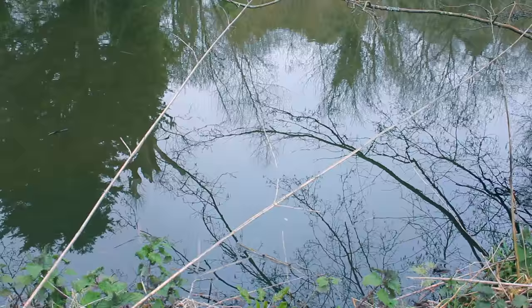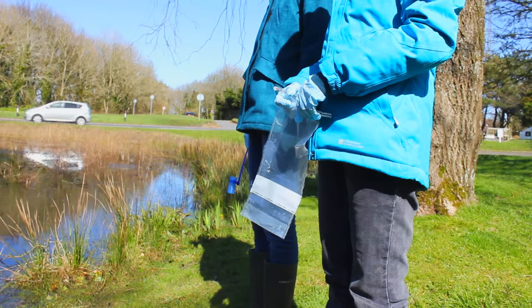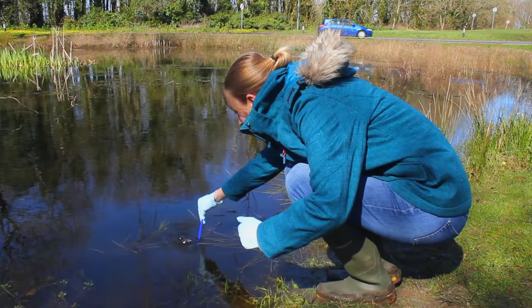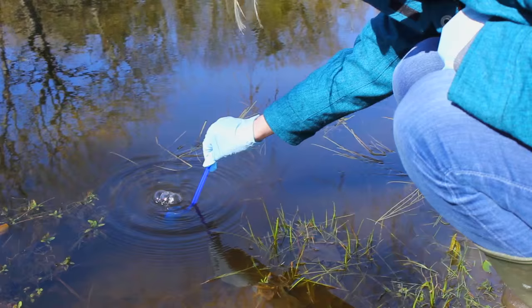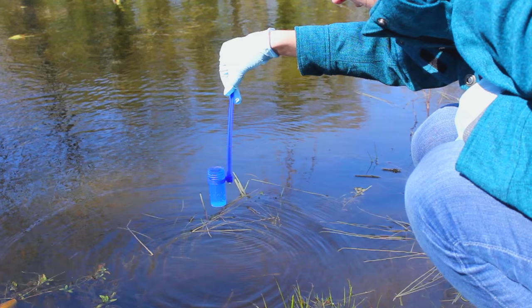The only thing to remember is, after you've finished, don't use the same stick at another pond without cleaning it first, because you could cross-contaminate eDNA samples between water bodies. There's a bit of an art to collecting a water sample. DNA is heavy and tends to sink, so I'm going to use the ladle to very gently mix the water column from the surface to close to the bottom, but without disturbing the mud at the bottom, which could contaminate the sample.